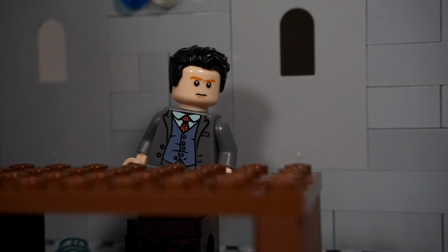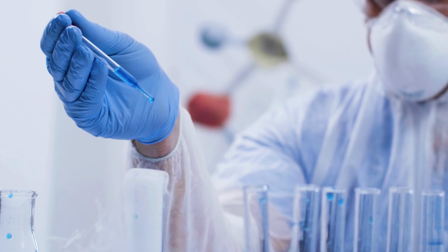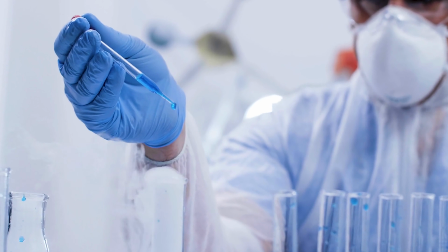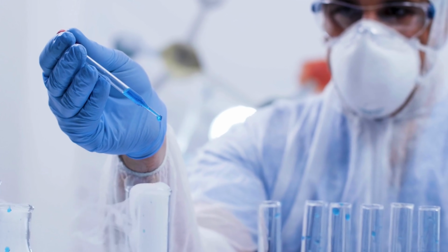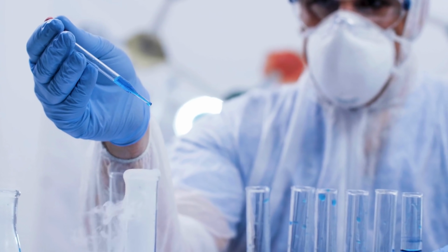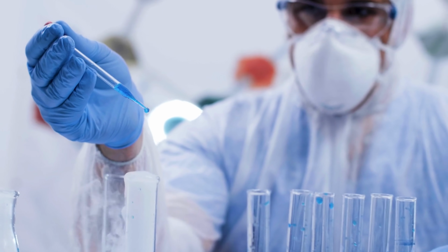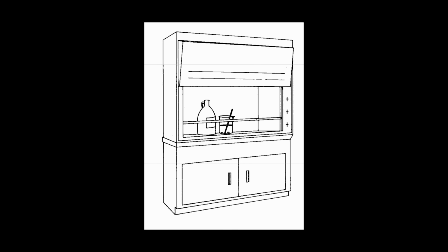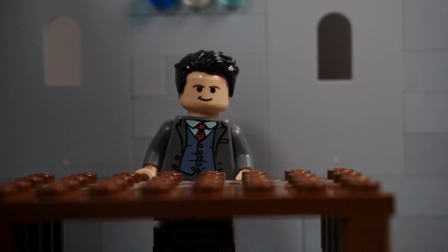Toxic fumes may be involved in the lab, and they can be dangerous. If you can smell it, it can probably hurt you. If smelling something is part of the assignment, waft it towards yourself, and do not put your nose right up to it. Use fume exhaust hoods when working with fumes that can be dangerous. The exhaust hood is equipped with fans that draw dangerous vapor away from the user. They have safety glass that will protect you from the chemical reactions, which can also be left open to keep a constant flow of air. The most common types of injuries in a lab are simple cuts and burns.